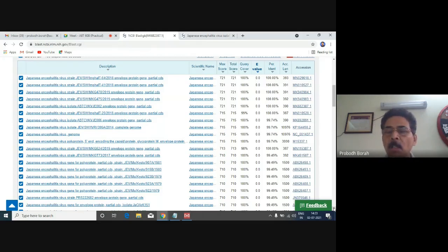So for that, we will not download many sequences today. You can download as many sequences as you like, but today, so that we can complete the practical within short time, we shall only download 5 or 6 sequences to have a comparison.